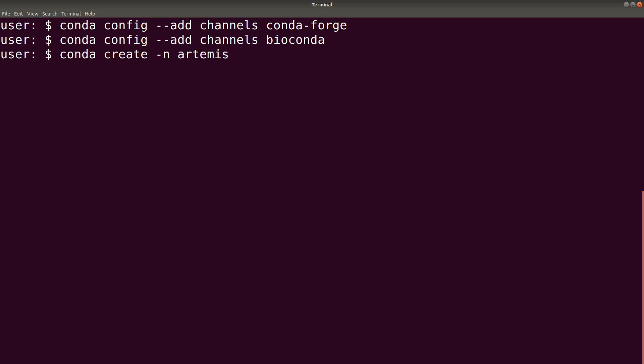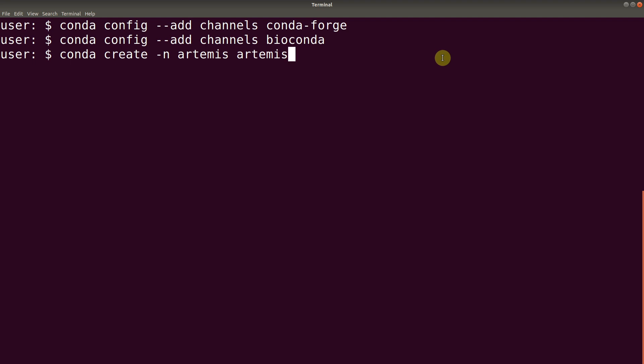So after we are done with this command, then we add the other option which is the Artemis software itself. So what we will do is that we are creating this environment and in the process of creating, we also install Artemis as well. So now we proceed and we hit the Enter key.